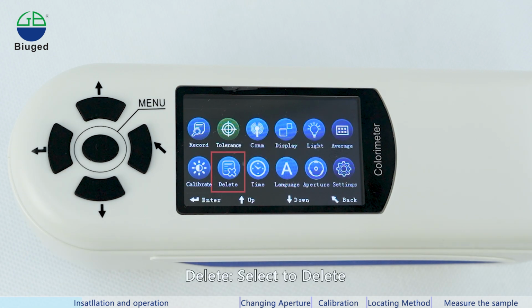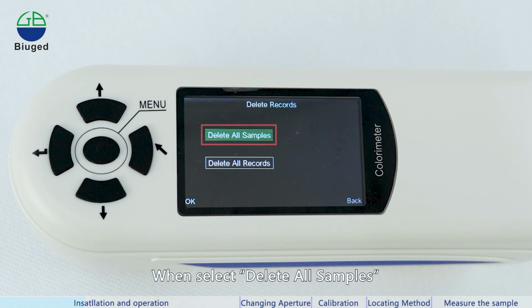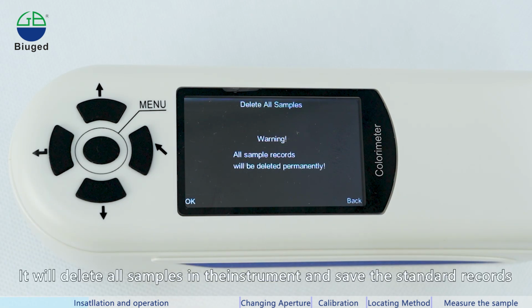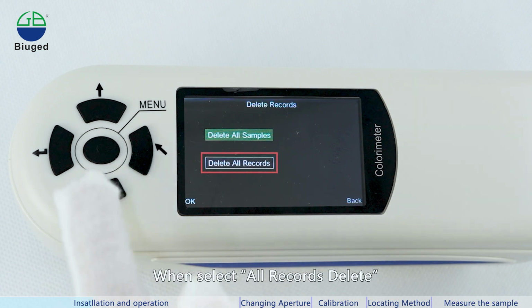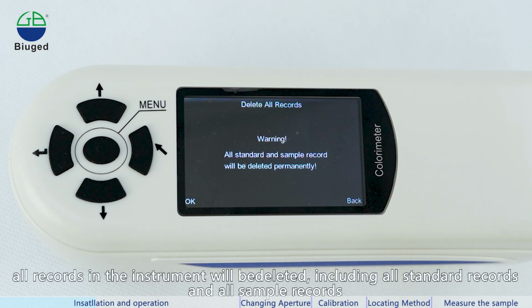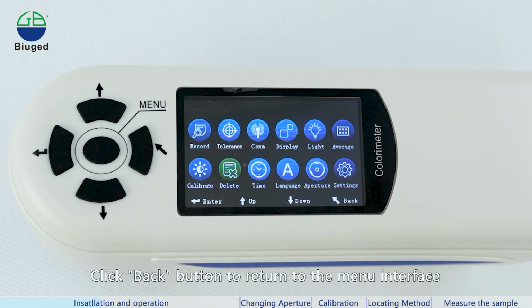Delete, select Delete. Click the Enter button to enter the Delete Records interface. When you select Delete All Samples, it will delete all samples in the instrument and keep the standard records. When you select All Records Delete, all records in the instrument will be deleted, including all standard records and all sample records. Click the Back button to return to the menu interface.